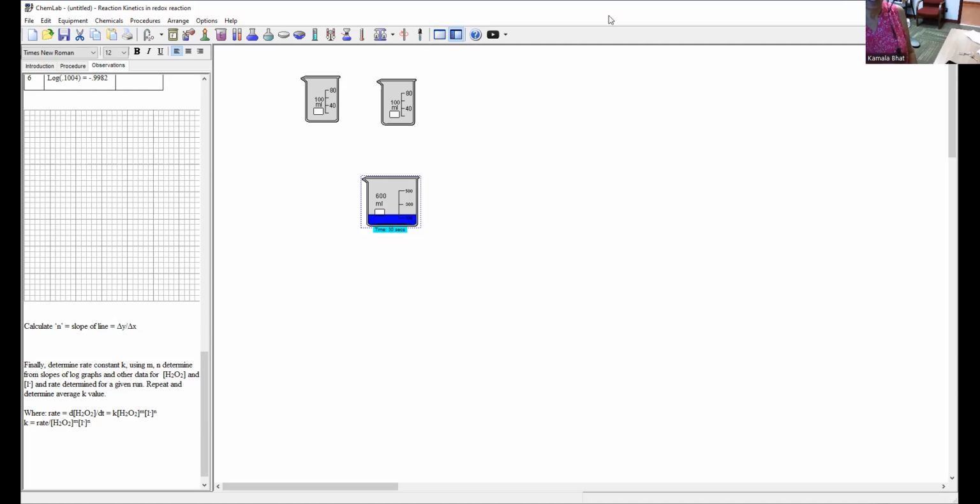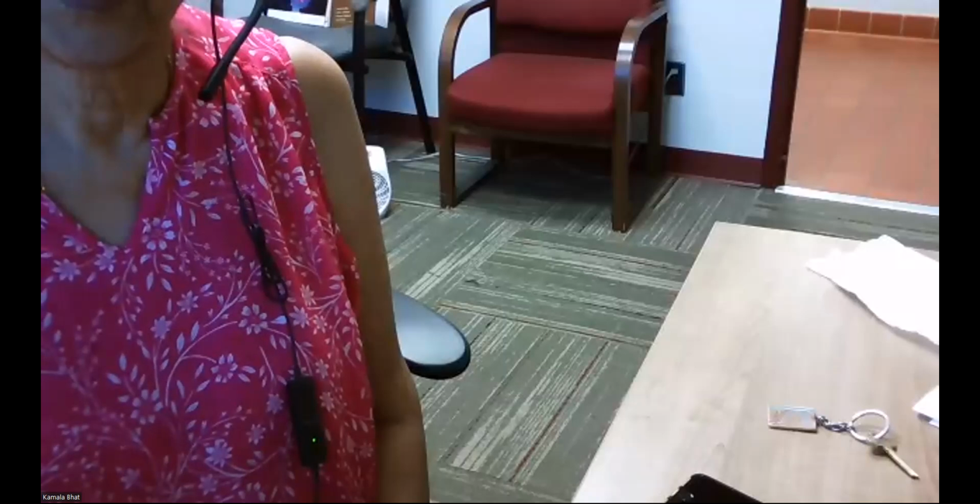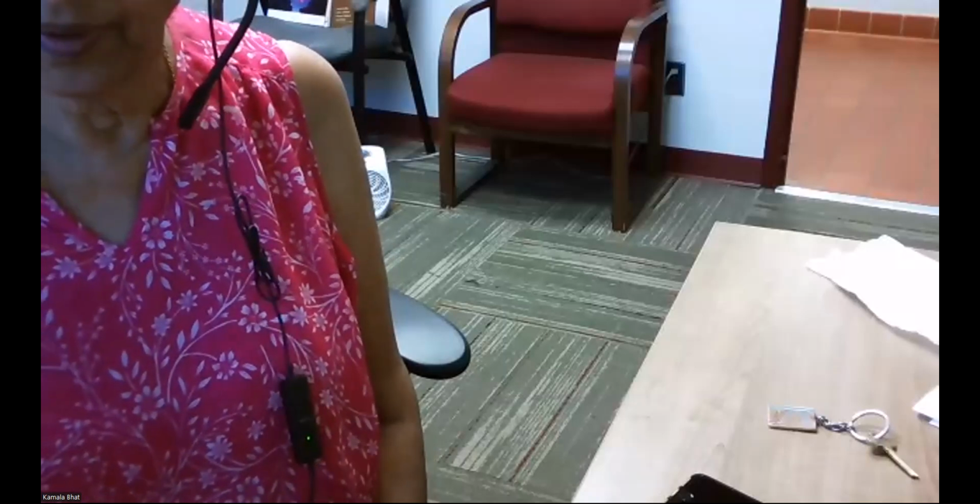And with that, make sure all the pictures are taken for each of the sets and record them, copy and paste them onto your Word document, then complete the results, discussion, observation, and the homework. Save that and submit it. And we stop the reaction.